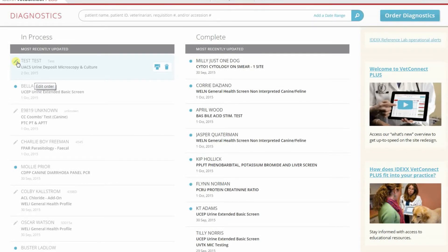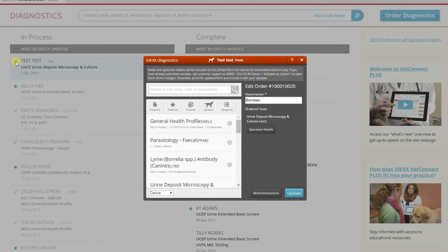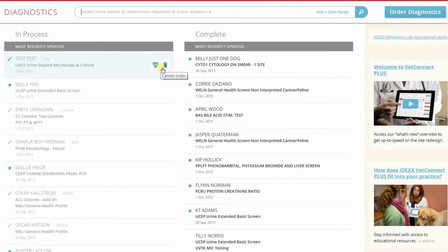Orders that have a pencil icon can be modified because they have not yet been accessioned at the reference laboratory — we call these editable orders. Once the reference laboratory begins to process the tests, the pencil icon will be removed. You can also reprint the order form or delete the order if it has not been sent to the laboratory.